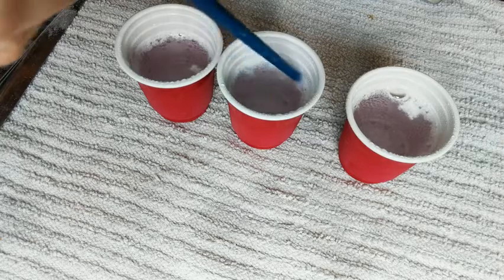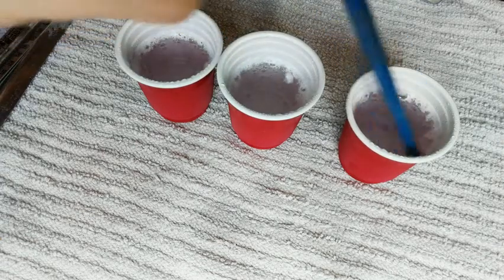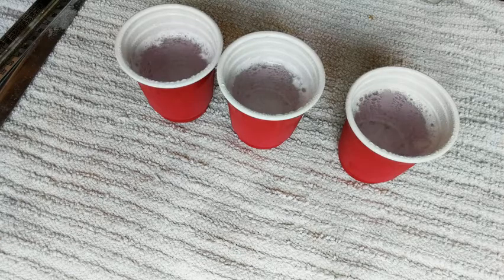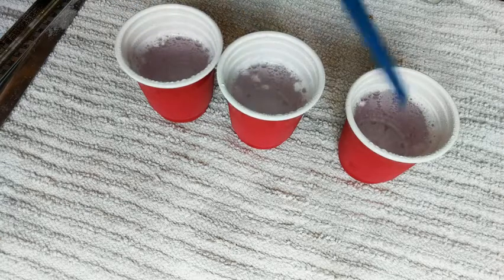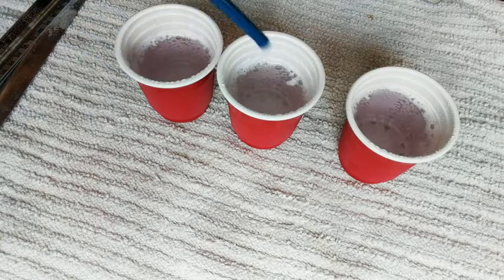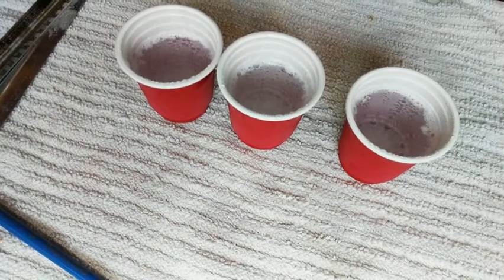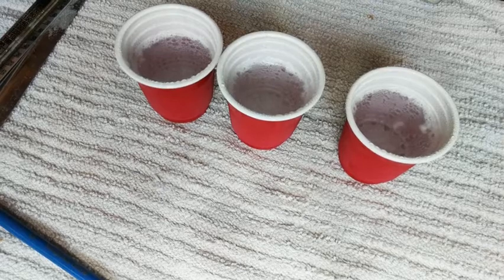Still got some chunks in there. Good thing to keep stirring. I don't want to stir too much though, because that's kind of a variable too. Stirring can also speed up reaction rate. So, all right. I think it's safe to say that we are pretty much done here. Both of them. All right. I'm going to stop that at 3 minutes and 18 seconds.